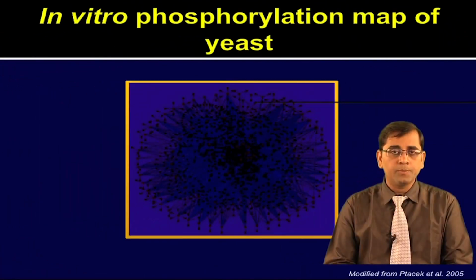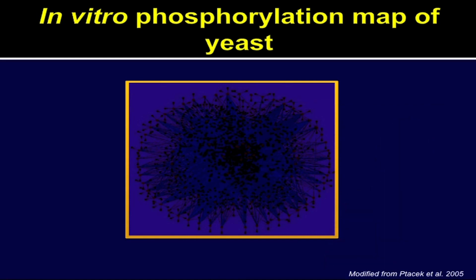These types of high throughput approaches can further be used to build the map and show the connection between kinases and substrates. In summary, microarrays have been used for surveying both antigens and antibodies and have been used for various types of applications, including in human, yeast, E. coli and other organisms. I have tried to cover some of the applications based on protein microarrays. However, there are numerous applications which could not be covered here.